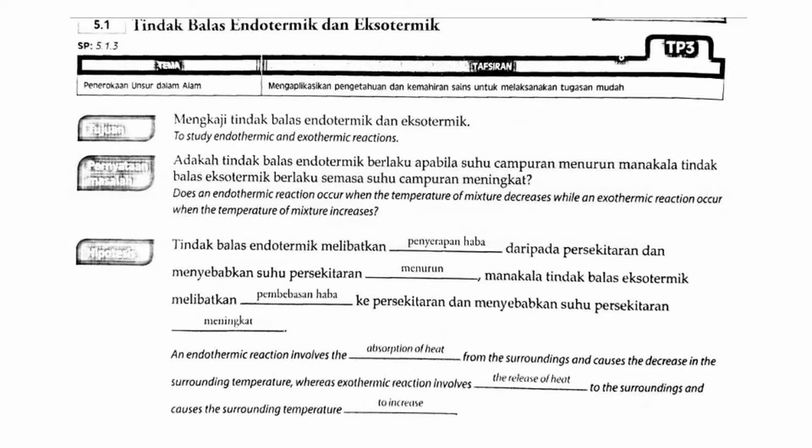Problem statement: does an endothermic reaction occur when the temperature of the mixture decreases, while an exothermic reaction occurs when the temperature of the mixture increases?